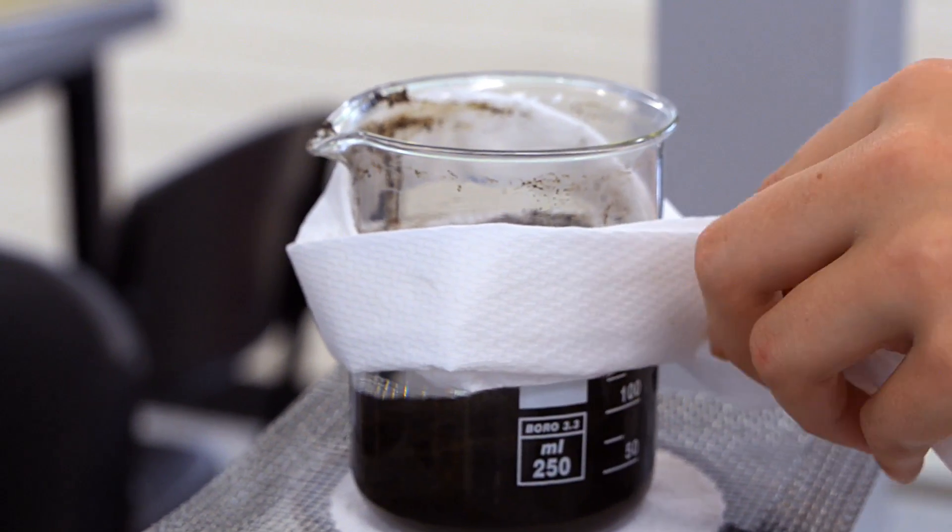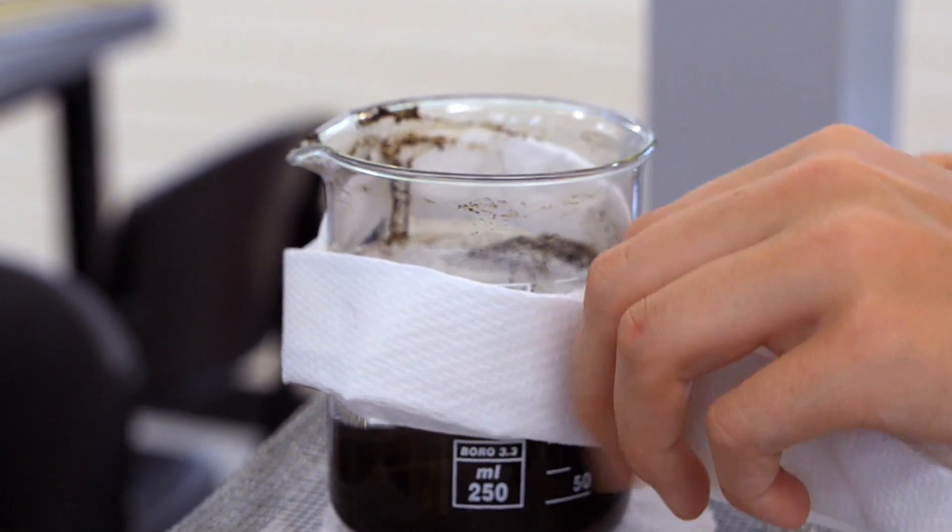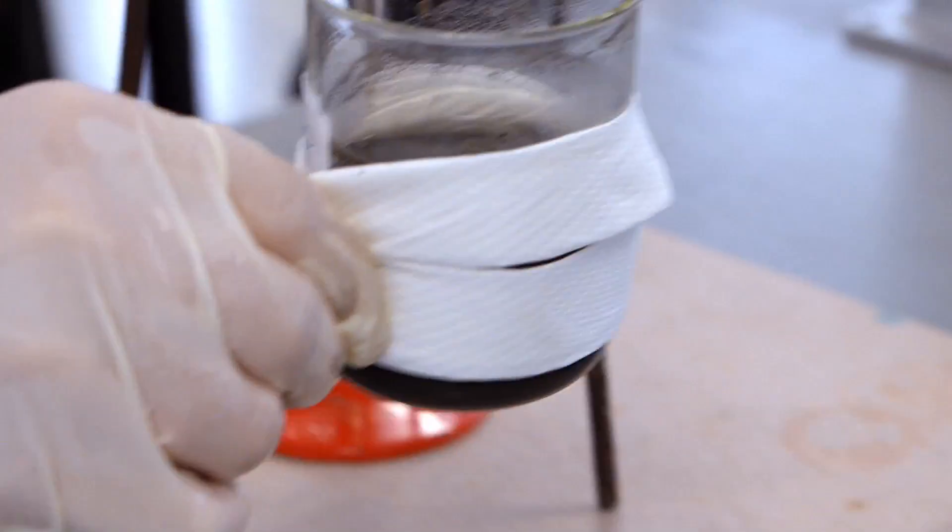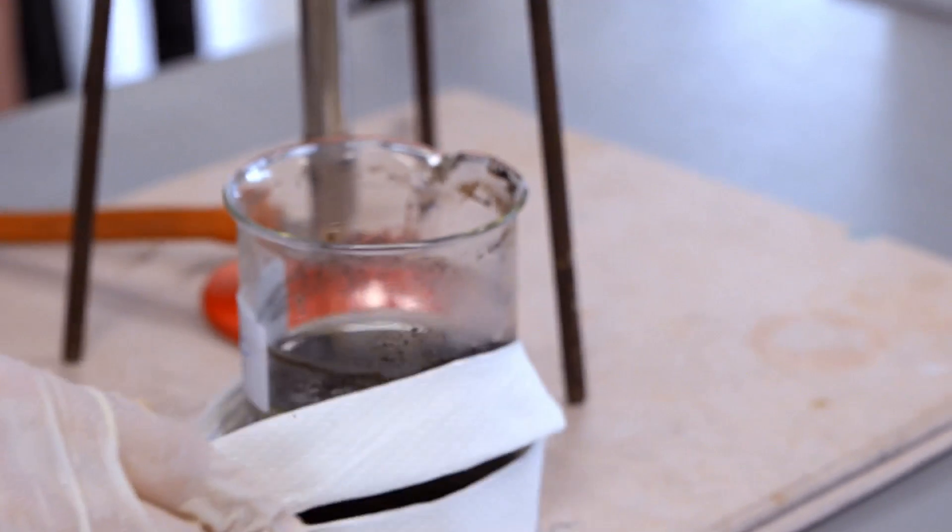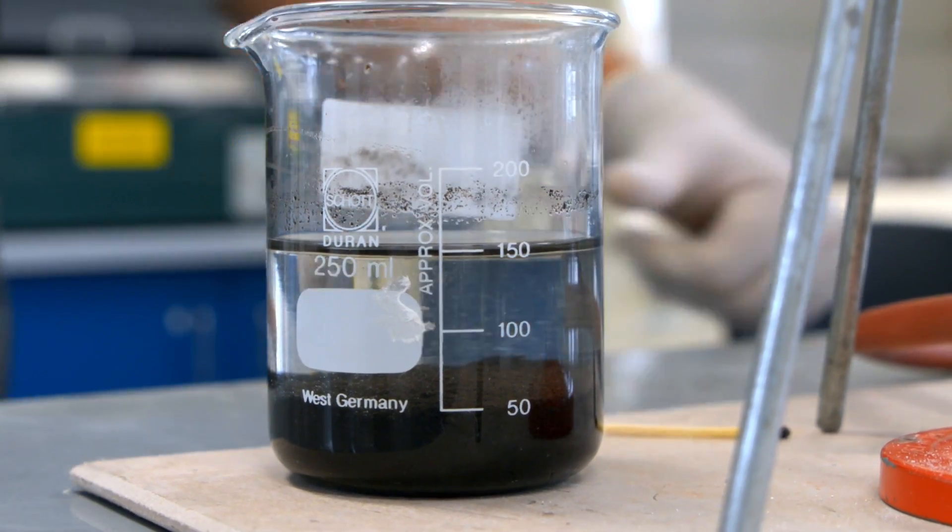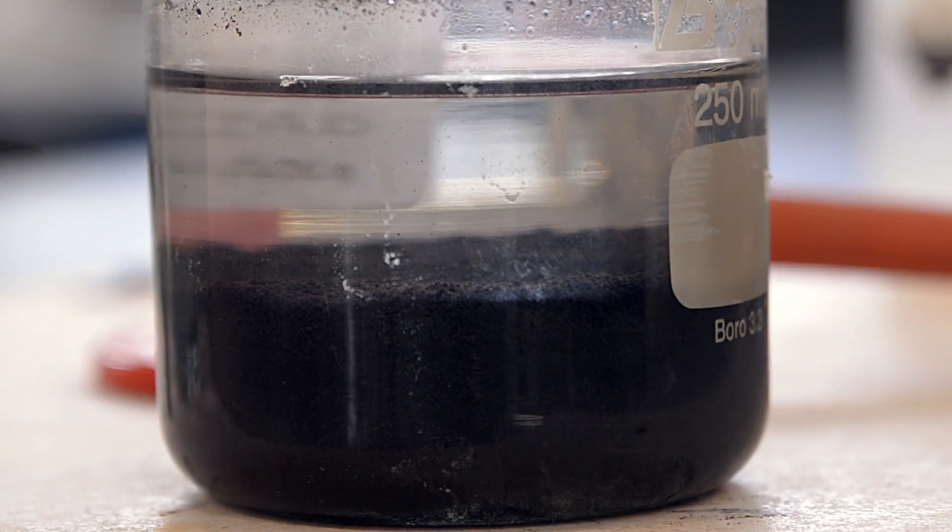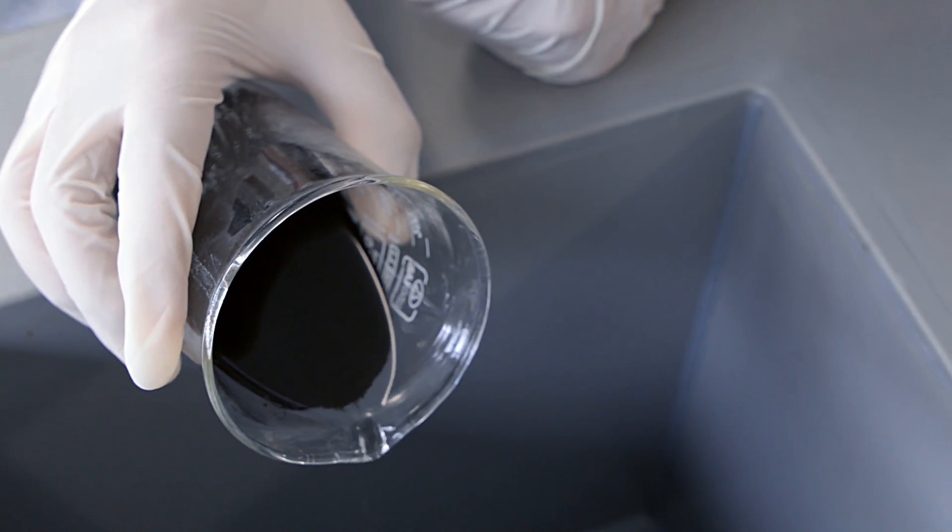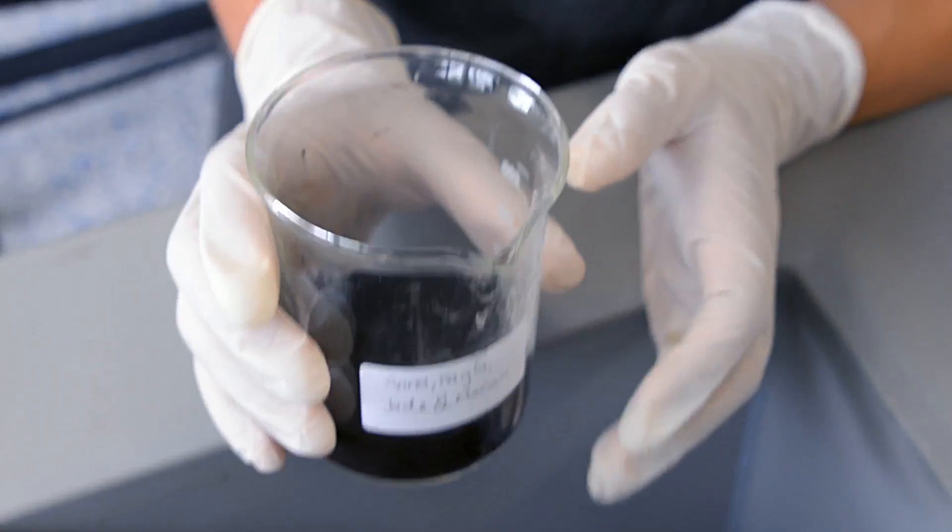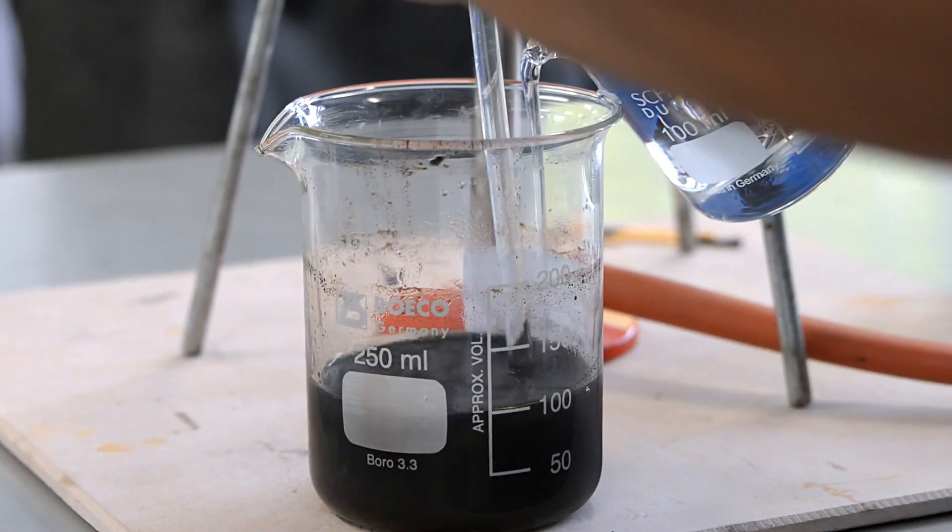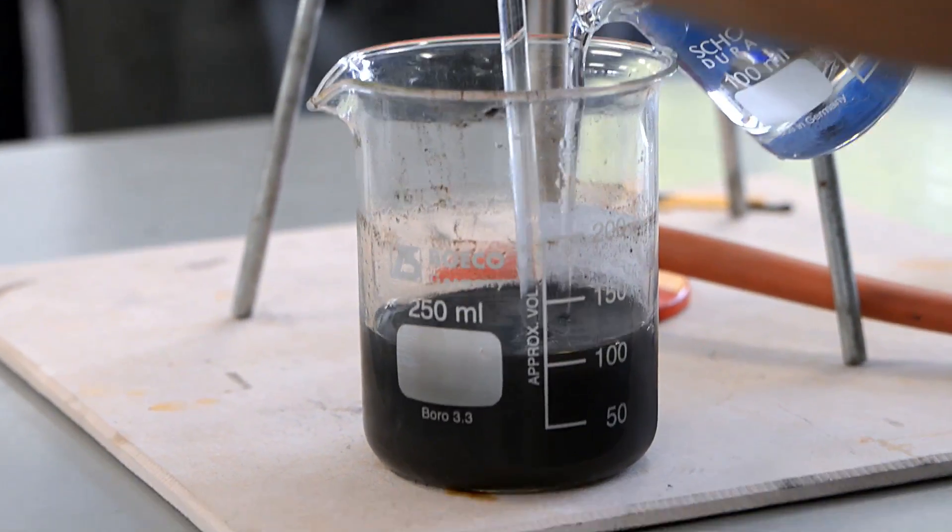The students here are demonstrating a trick to grab the beaker without using steel tongs, which would be slippery. At this point the black solid had settled towards the bottom, enabling us to decant the liquid down the sink, careful not to lose any solid to maintain our product mass. We repeated the process another two times with 50 mL of distilled water each time.